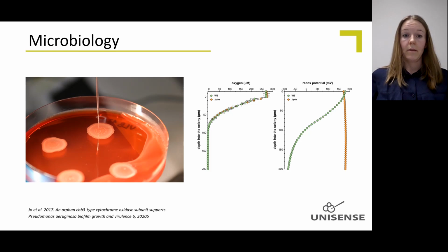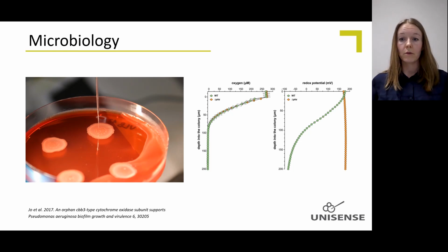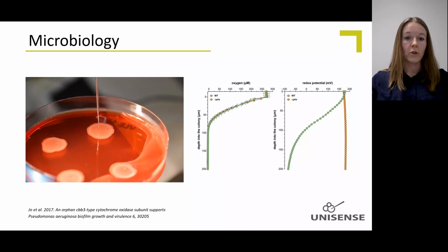In microbiology, microsensors are also used, and they are used to study both bacterial suspensions and biofilms. Here, microsensors are used to study the microenvironment inside a colony biofilm. The study shows here the oxygen profile and also the redox profiles in a colony biofilm that was only a few hundred micrometers thick.